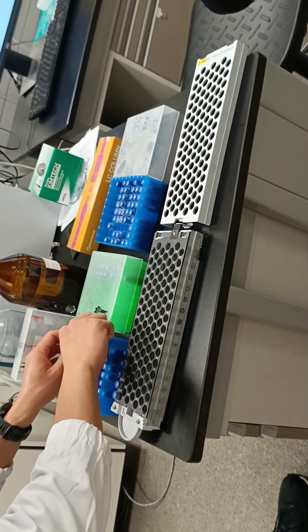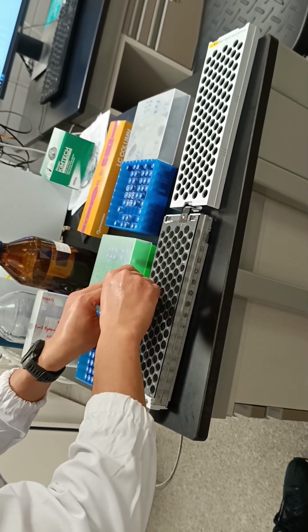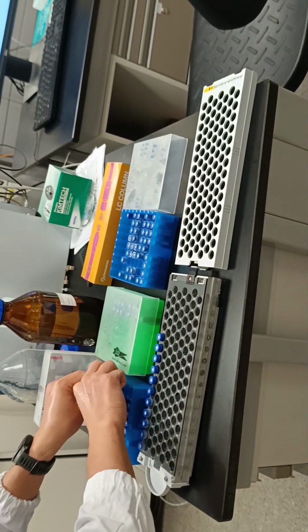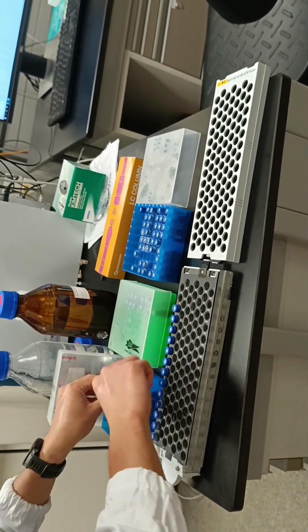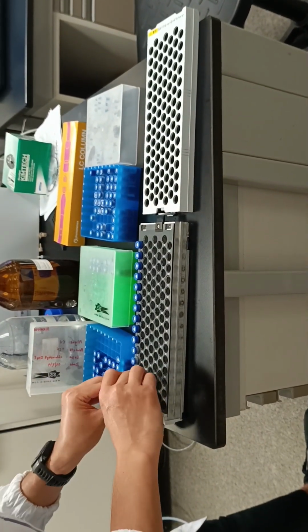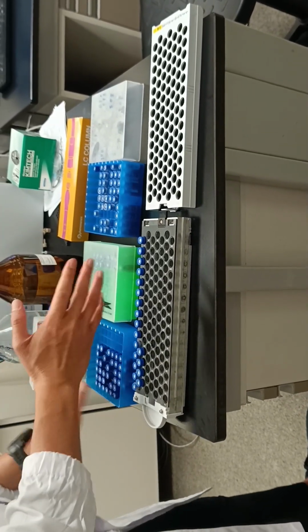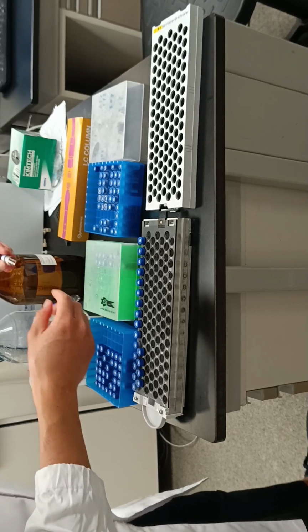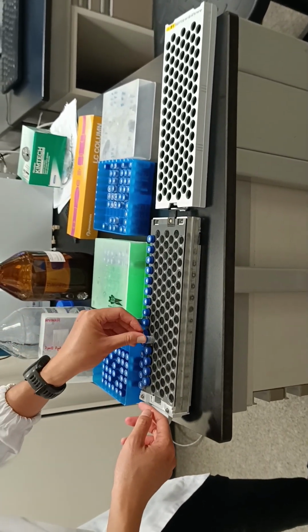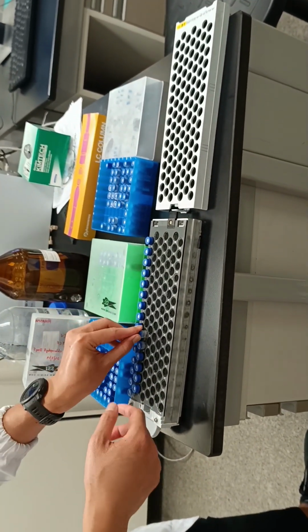So this one, I'll just randomize it. For my case, my practice is to load every 20 or 30 samples, then put one blank and one QC. But it's up to you. You can choose your own pattern. This is my own pattern.